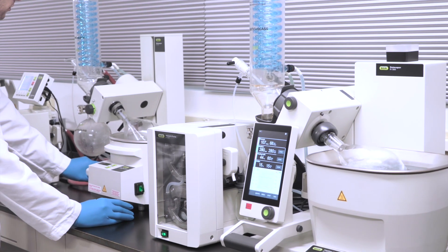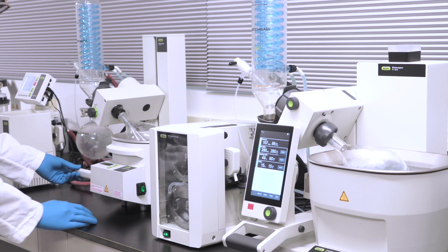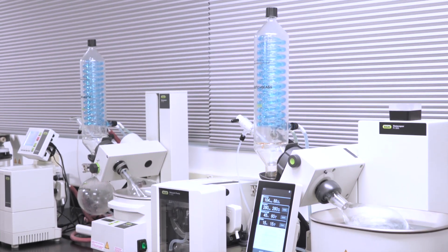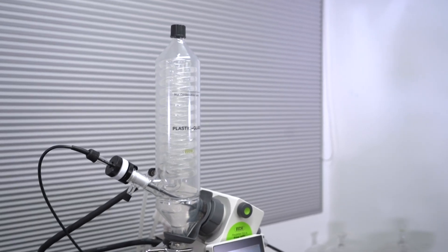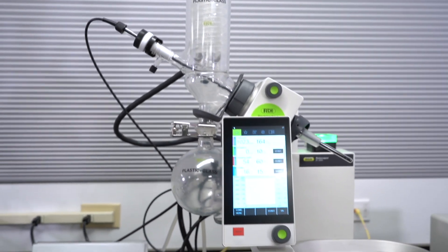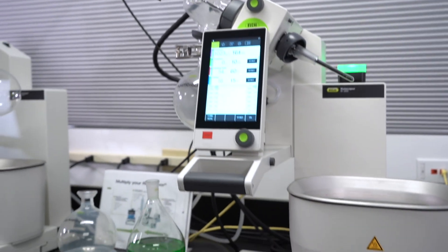The R300 and R100 both fill a critical role in the lab. In essence, they follow the same physics to remove solvent from samples — applying heat to samples under vacuum — allowing for a gentler and more efficient distillation. While the R100 performs the essentials, the R300 is modular and allows the user to add accessories to expand functionality.